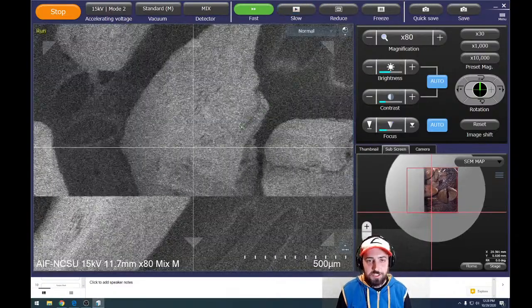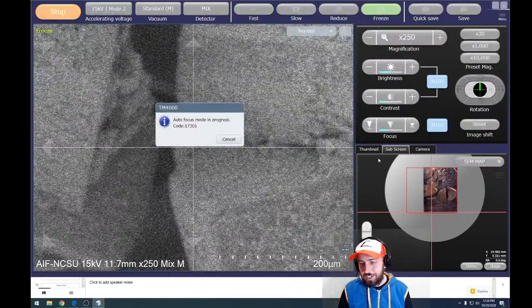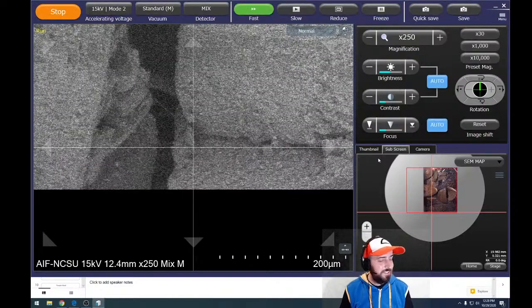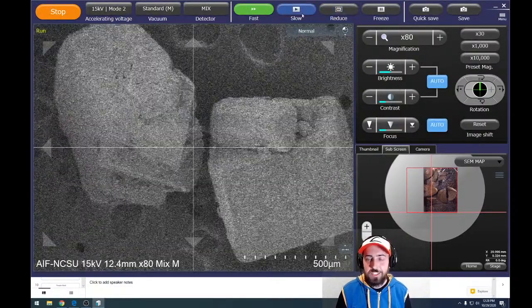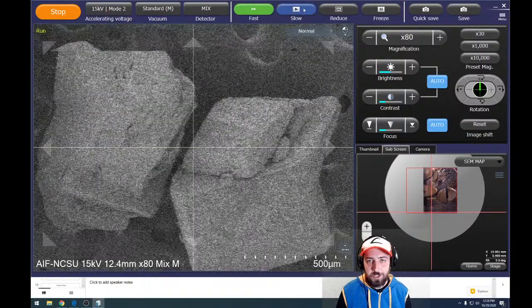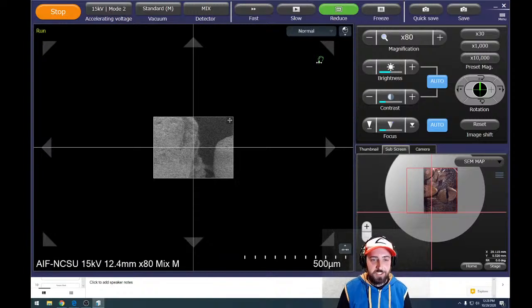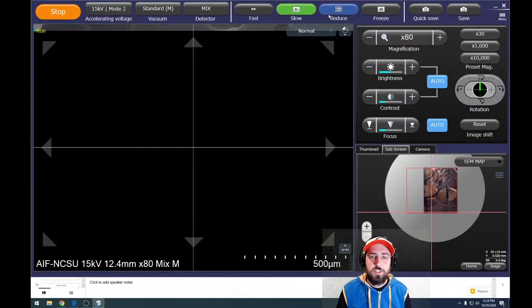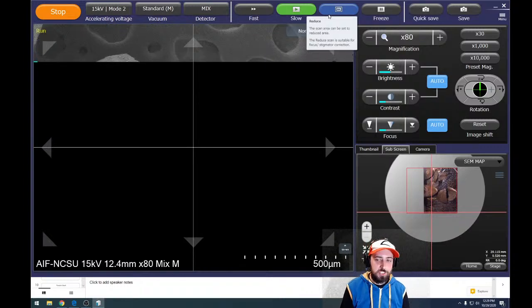Let's go up to this one. I think I'm running out of room on my microscope. So yeah, my sample stub is too big, and I didn't think about that for today's lesson. There are some parts of my stub that I can't actually navigate to. Oops. All right, so now we're scanning slow, again at the same magnification that we were just looking at the white sugar.